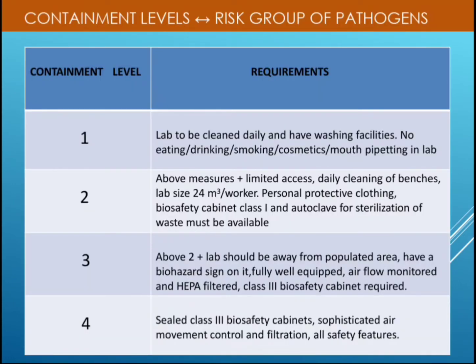Containment levels and risk groups of pathogens. The first containment level: the lab is to be cleaned daily and have washing facilities. No eating, drinking, smoking, cosmetics, or mouth pipetting in the laboratory. Second containment level: all the requirements of containment level one, plus limited access and daily cleaning of benches.